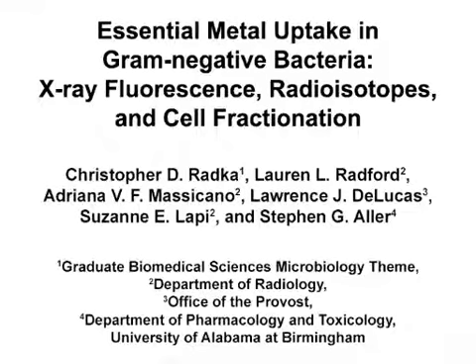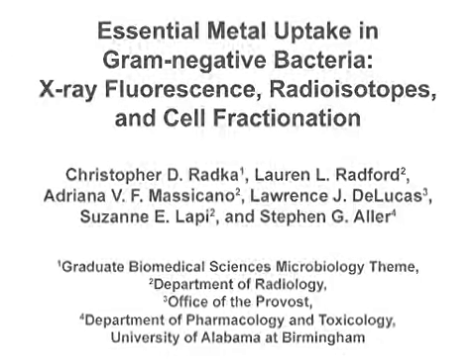The overall goal of this technique is to extract bacterial periplasmic contents by cell fractionation for biophysical characterization, including X-ray fluorescence, X-ray crystallography, and radiometal uptake. This method can help us understand key biological relationships, including structure-function relationships of ABC transport systems and how they recognize their substrates specifically and transport them into the cell through the lipid bilayer.